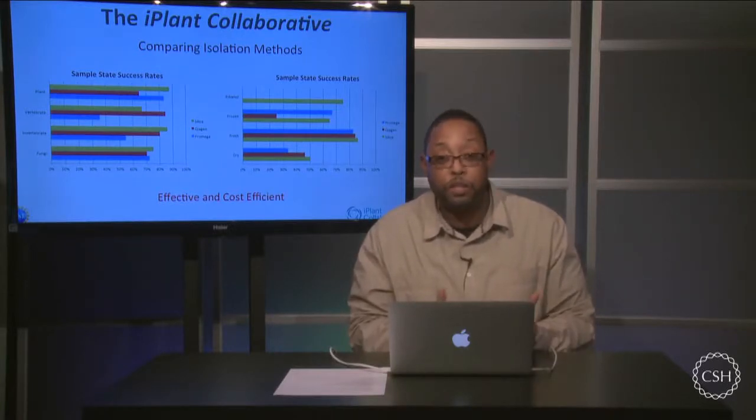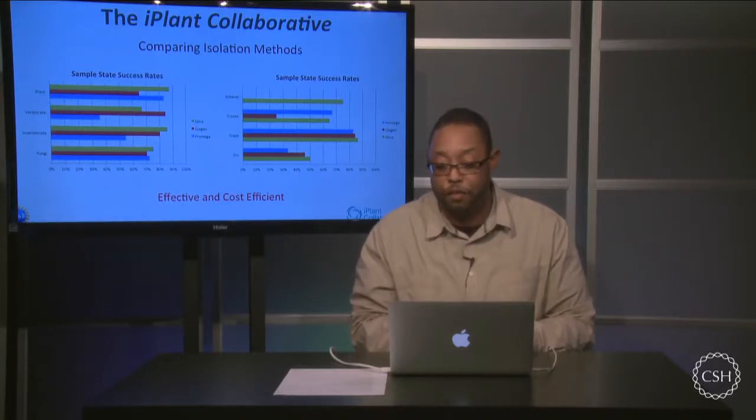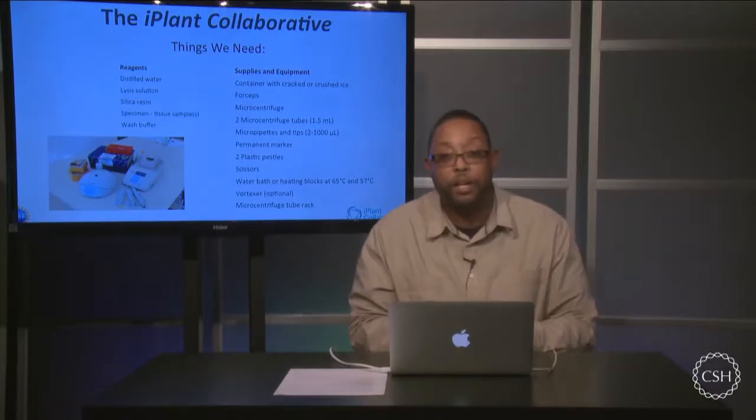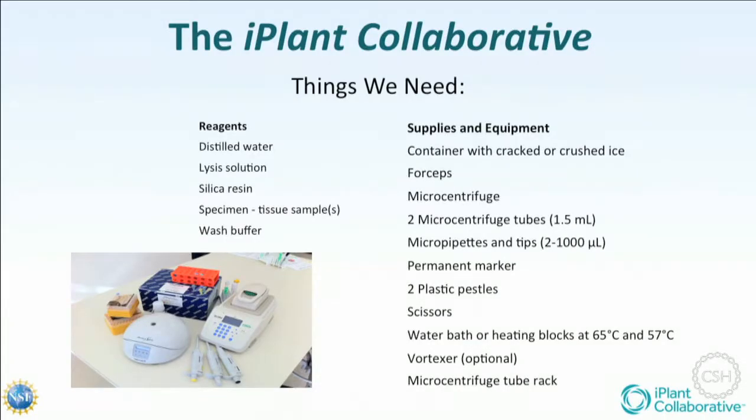So in this particular webinar, we're going to look at the silica DNA isolation as a technique for DNA barcoding. There are a few things that we're going to need to physically do this experiment. So I'm going to walk over and we're going to get started with this DNA isolation.